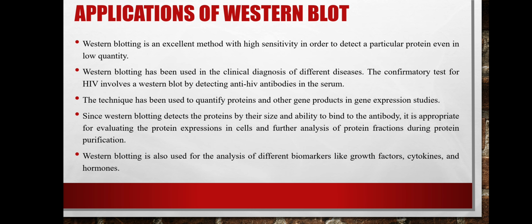It is also used for analysis of different biomarkers like growth factors, cytokines and hormones. So that is all about Western blotting. I have already discussed Southern, Northern and Western blotting.